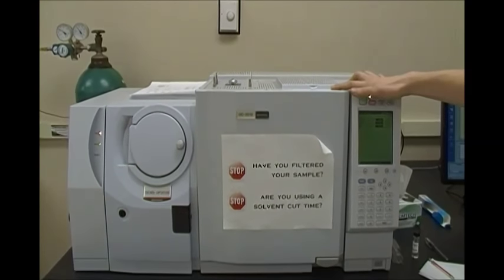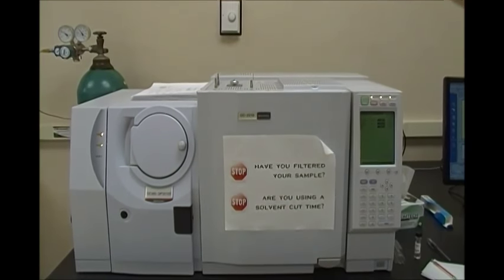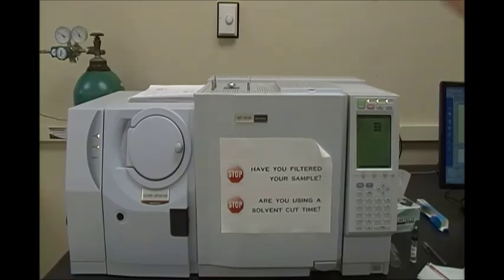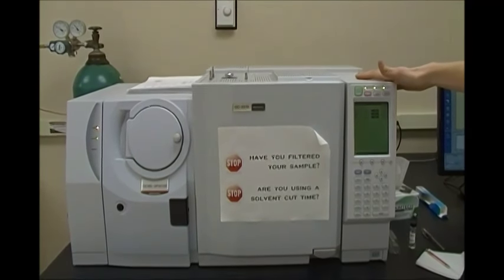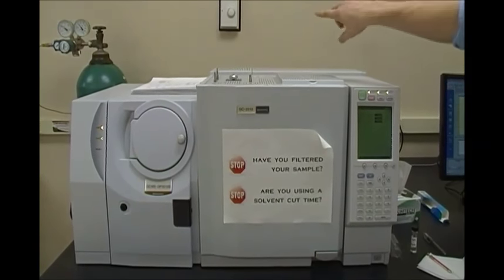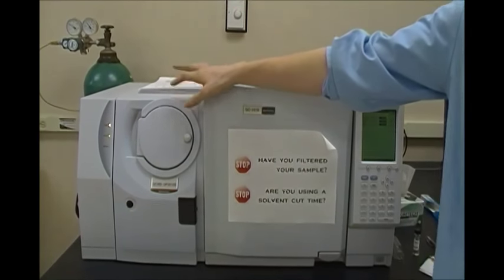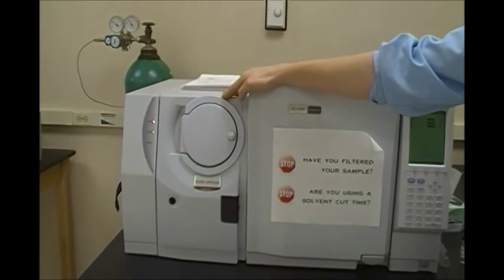Our mobile phase is going to be helium gas, which is in that tank back there. So the helium gas will push our sample through our stationary phase. It'll go through our coiled column and then exit here, coming to the mass spec.